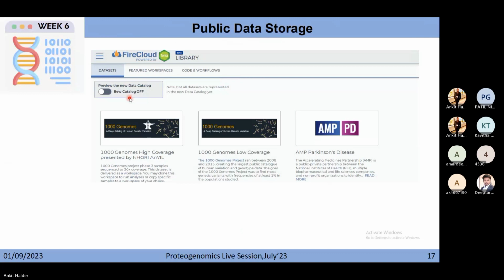When you have a huge number of samples to analyze, if you have an automated script and an automated way of analysis, it becomes quite easy to change a certain step of the analysis, or to identify certain sets of proteins and peptides.